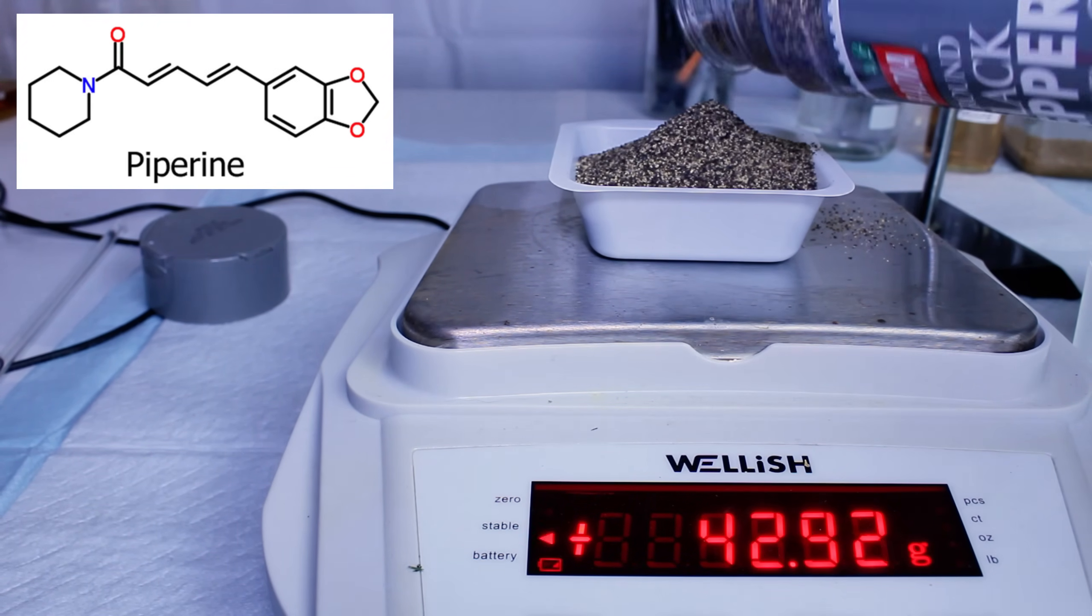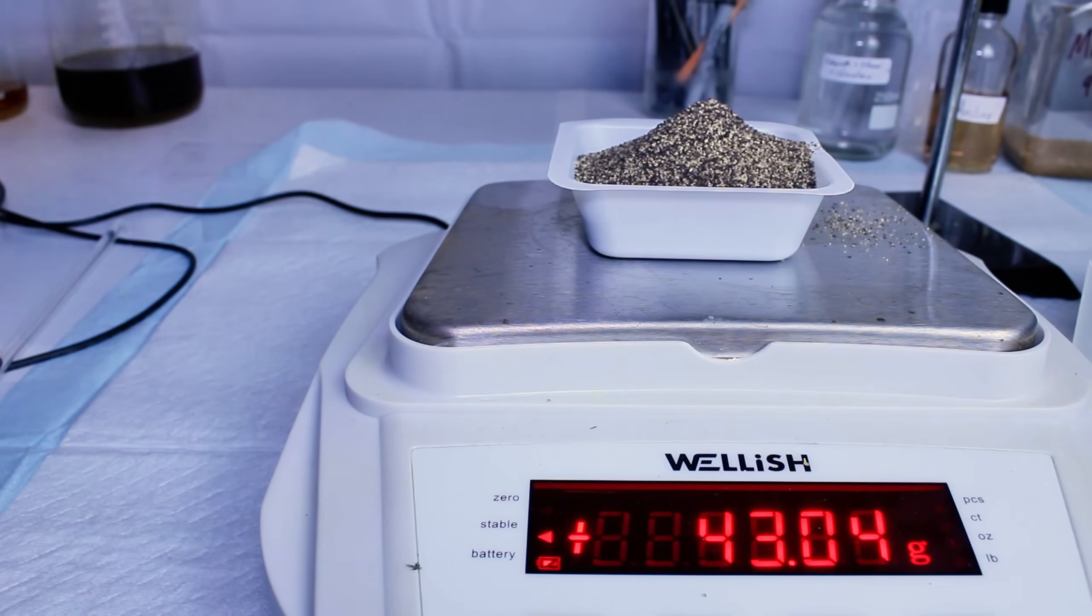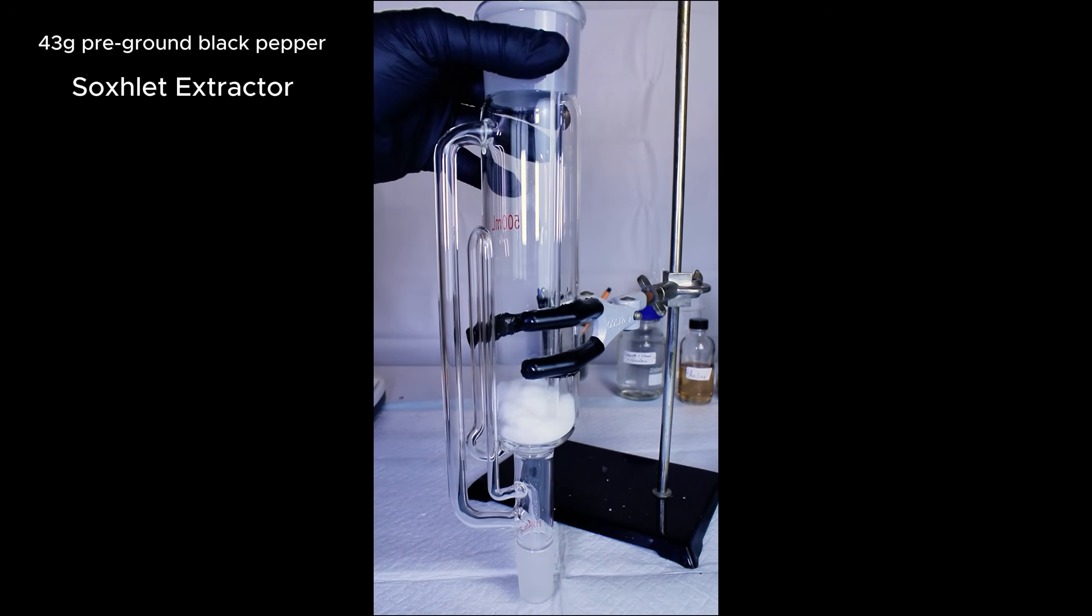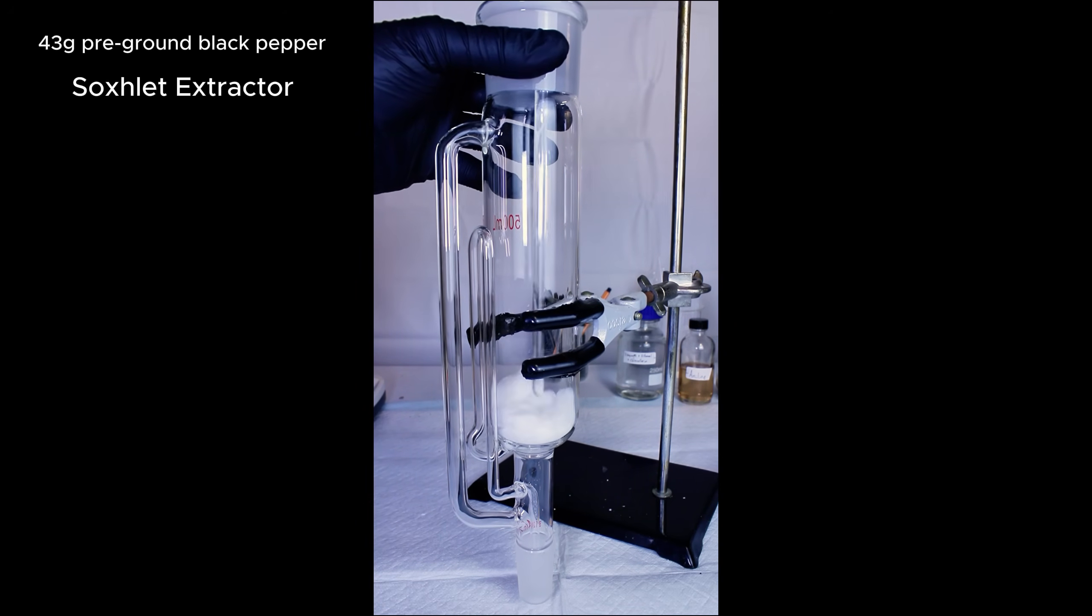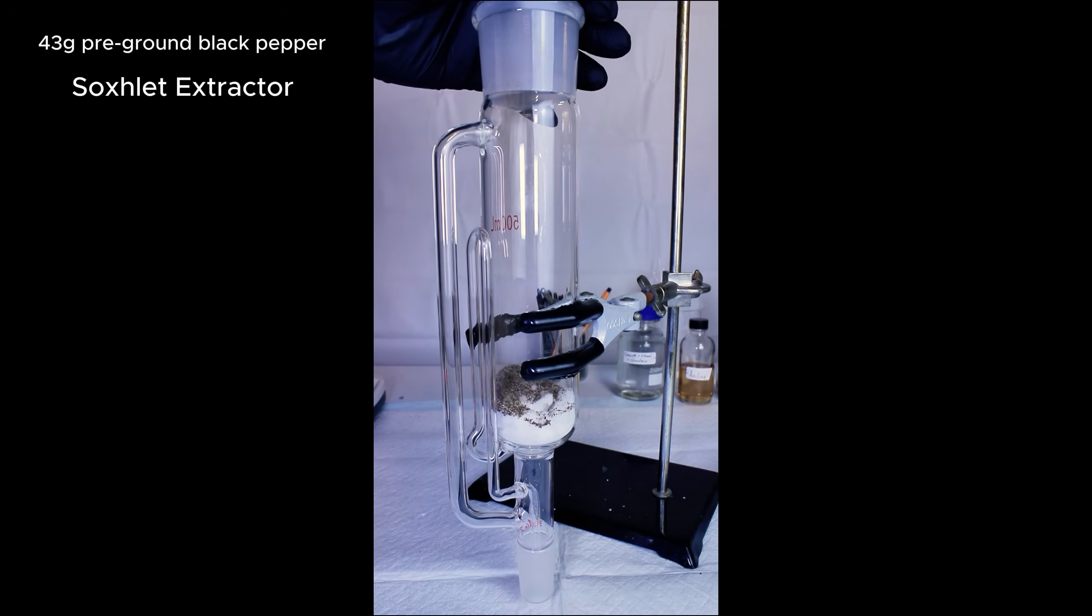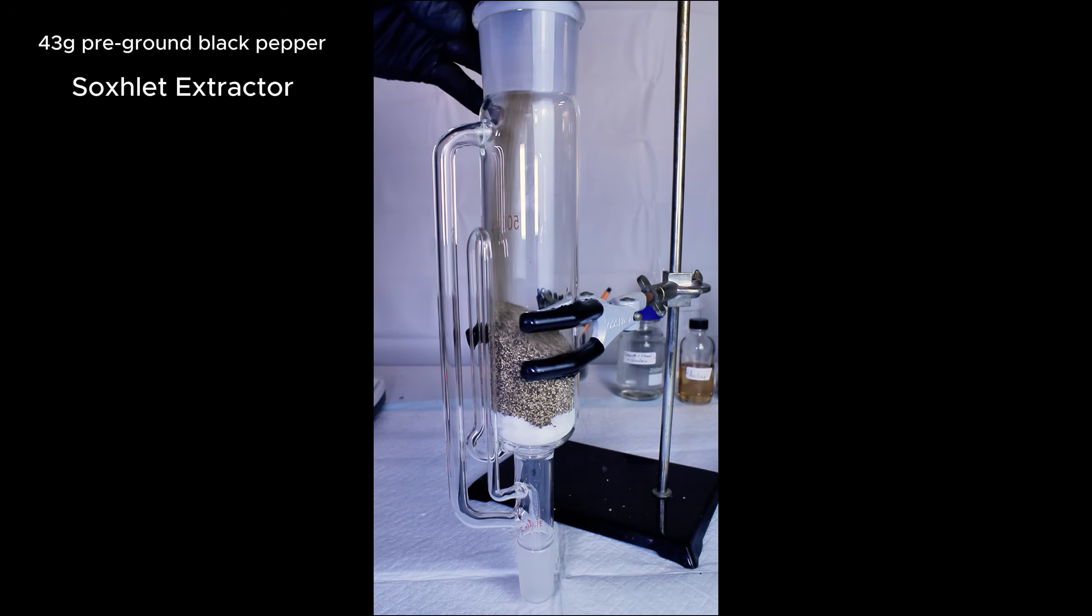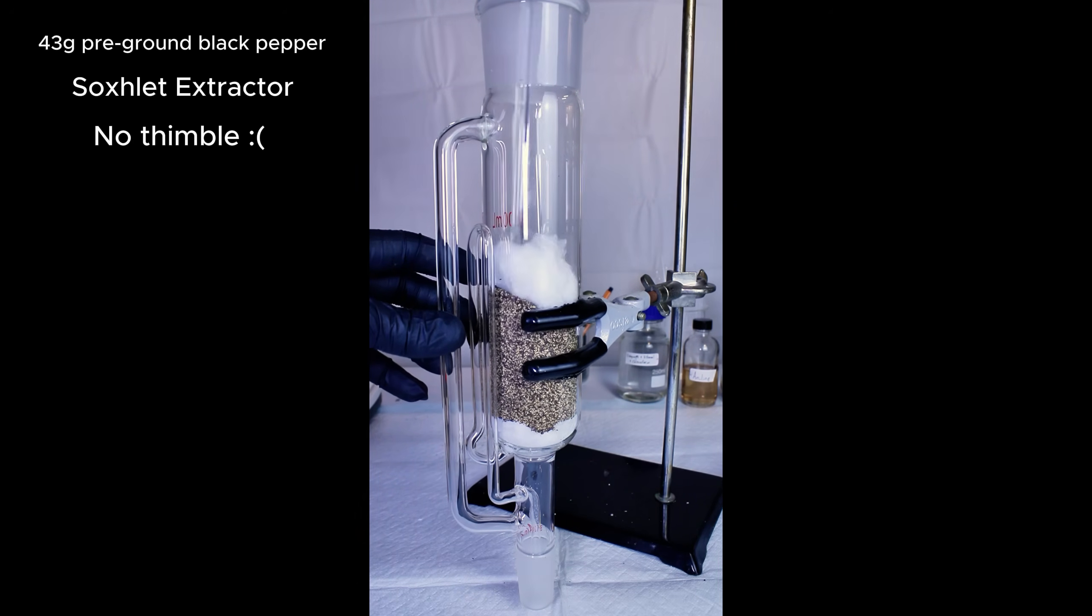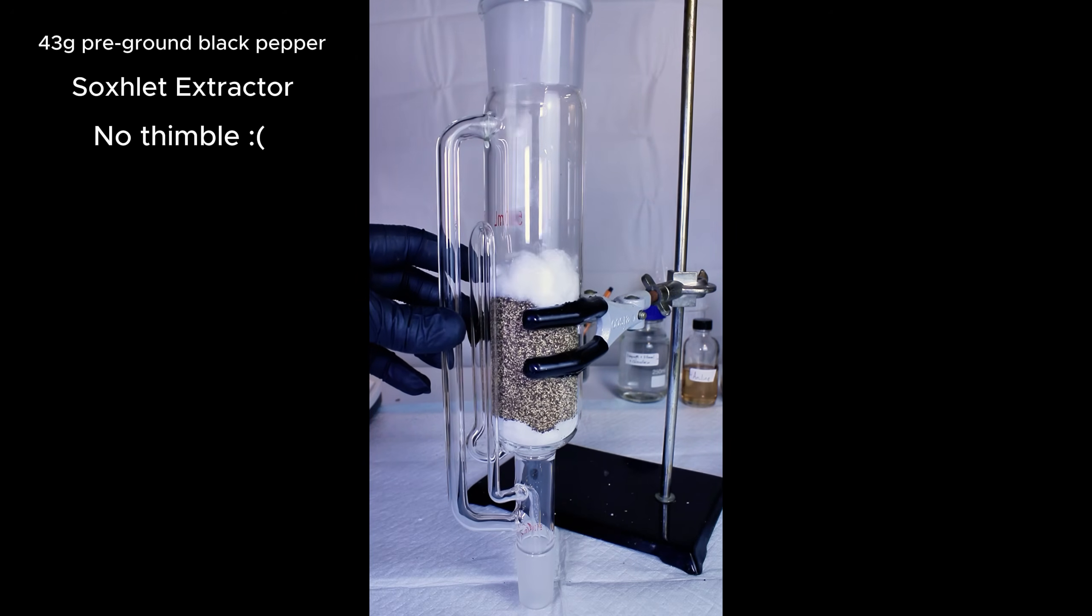To get started, I weigh out just about 43 grams of pre-ground black pepper and set it aside. Next, I cram a cotton ball into the bottom of this piece of glassware called a Soxhlet Extractor, which I've never demonstrated before on this channel. Once the cotton is in place, I pour in my black pepper and then put another cotton ball on top, and these two cotton balls are basically taking the place of a piece of glassware called a thimble that's supposed to sit inside of the Soxhlet Extractor.